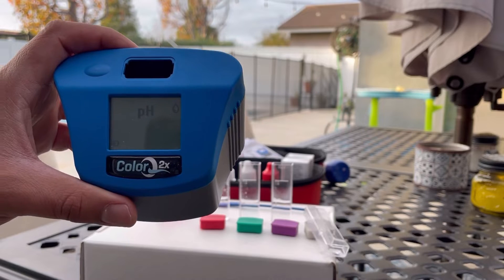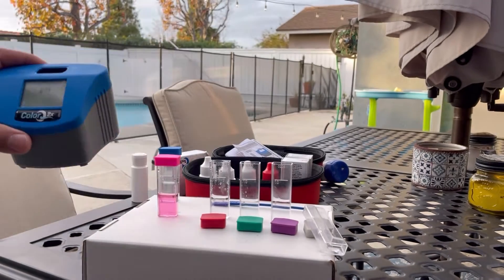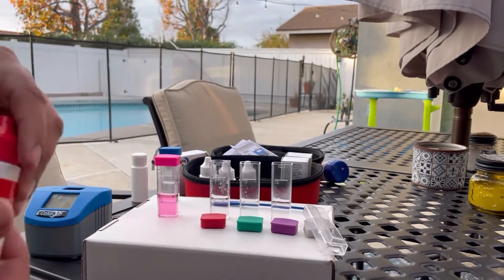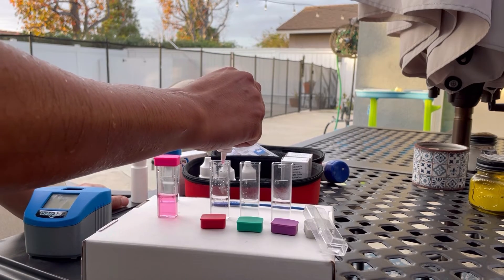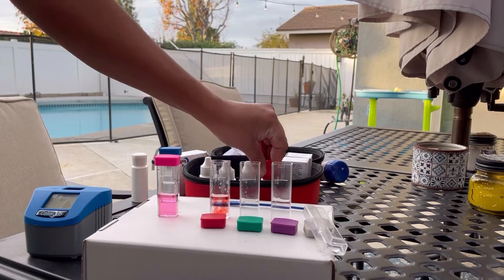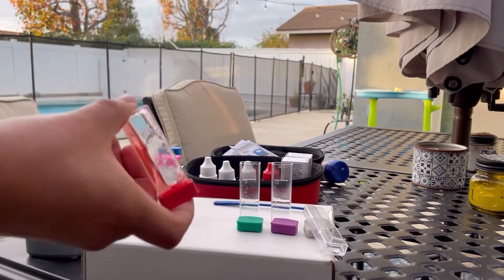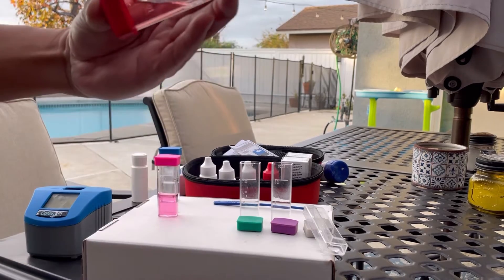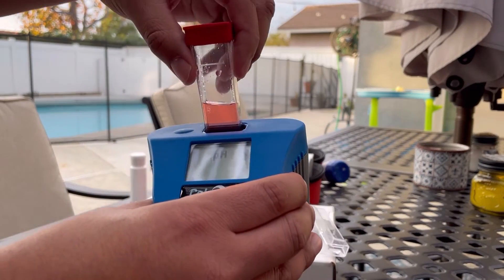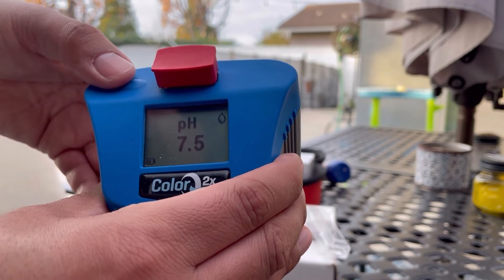We're going to do the pH next. I'm going to add five drops of the pH test solution — one, two, three, four, five. Put this back, put the lid on, invert it a couple times to get the air bubbles out, pop it in the unit, and press the button. Our pH is 7.5 — just where I want to be. All right, so we got that test out of the way.